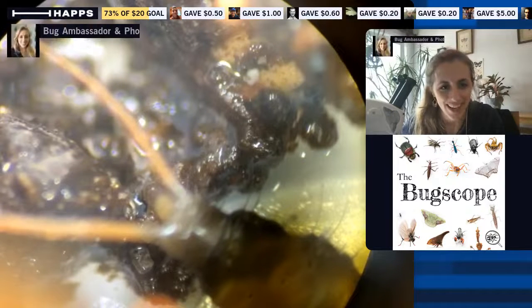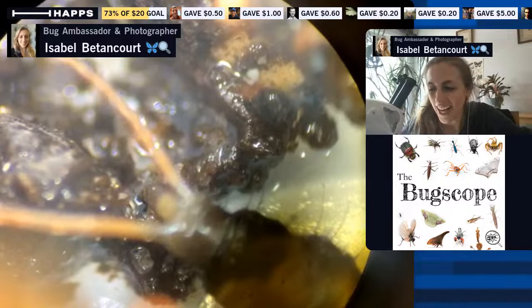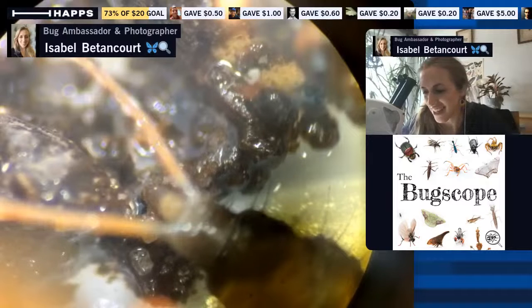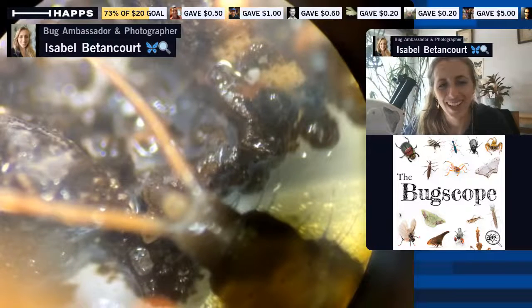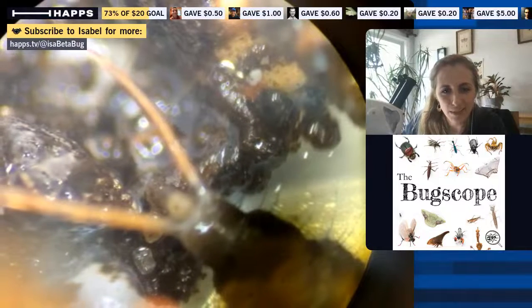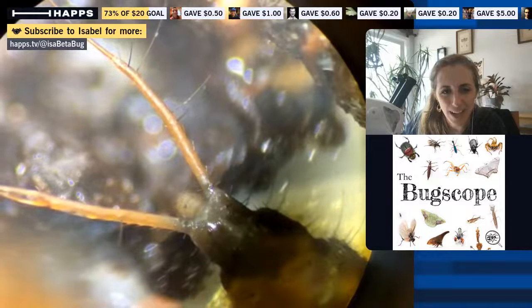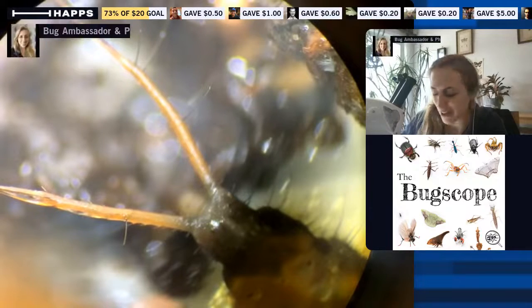Christine's saying maybe like the whiskers on a cat — yeah! I have my cat right here; if only she could talk and tell us all about her whiskers. Hi Mika. So I'll try to get it in focus. I feel like there's probably some interesting things going on with its back abdominal area that we need an expert to guide us on beyond general entomology knowledge.